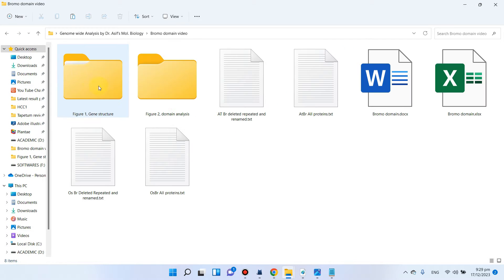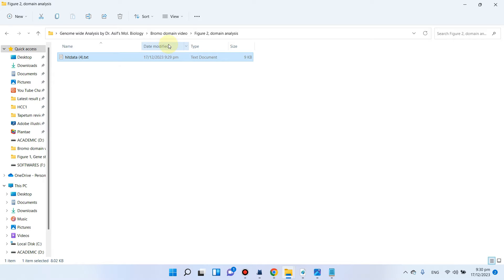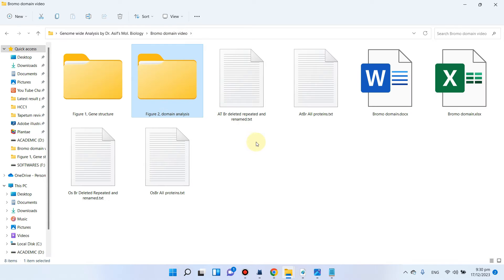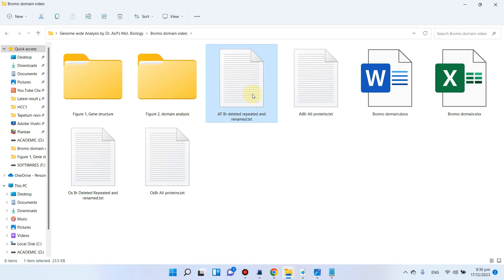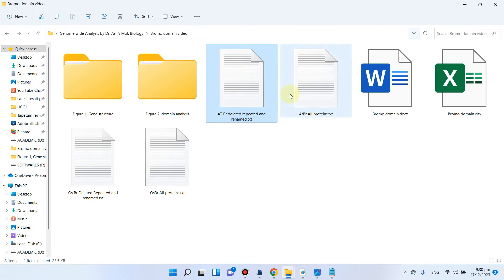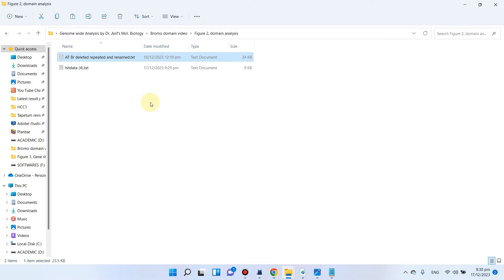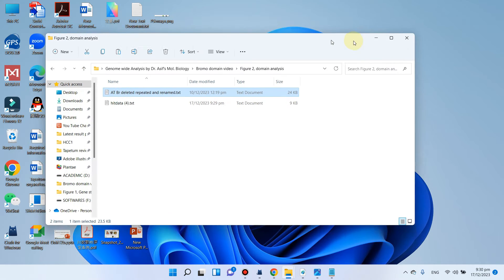We cut this downloaded file and move it to our Figure 2 folder for domain architecture analysis. We also save the input sequence file into our Figure 2 folder. We will be using these two files to create domain architecture analysis using TB tool.